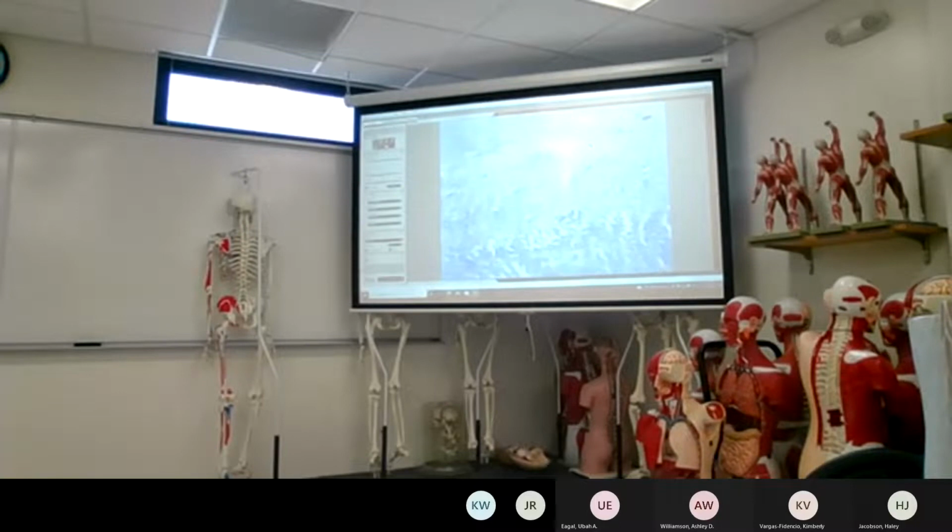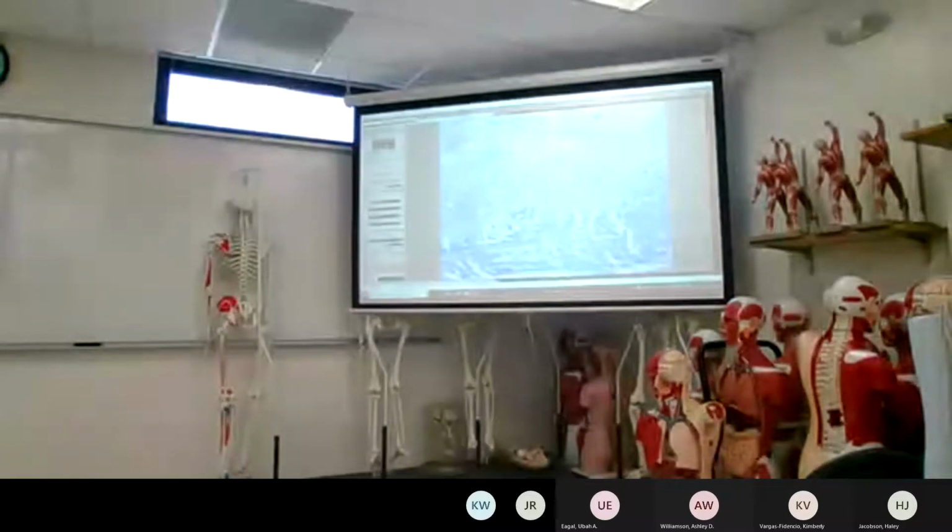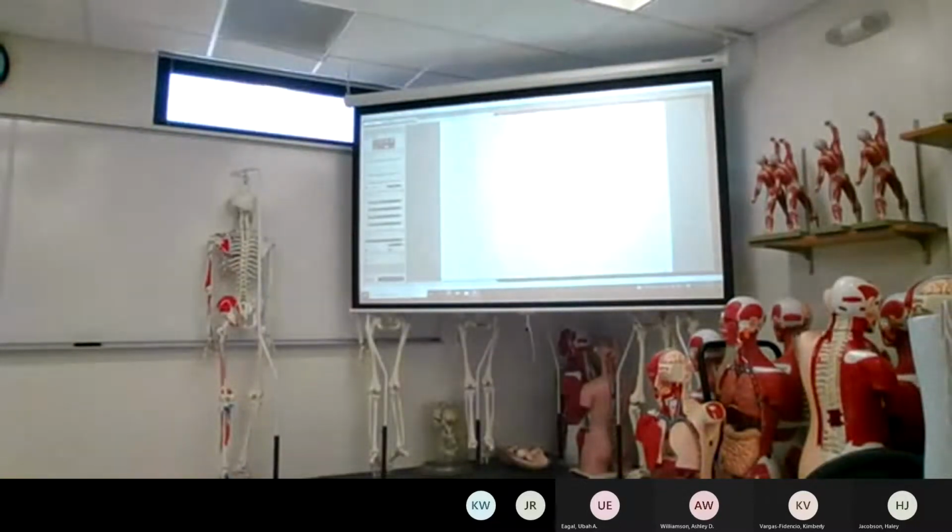There it is. Okay, so going up to low power so we can get a big cross section of this image. All right, so to be honest, it looks like there's a lot going on here, right? And there's nothing that really shouts out cartilage.